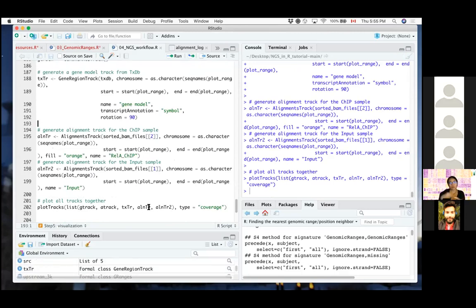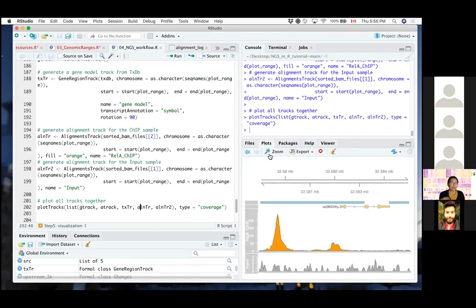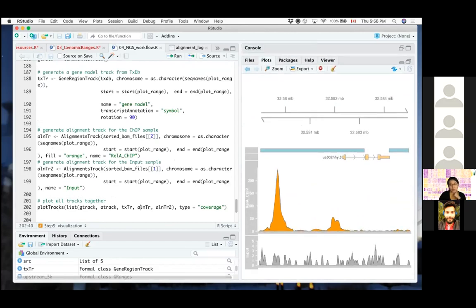So if you were to make the plots yourself, you might have to worry about lining them up perfectly, but with this package, it takes care of all these details for you in a coordinated fashion.